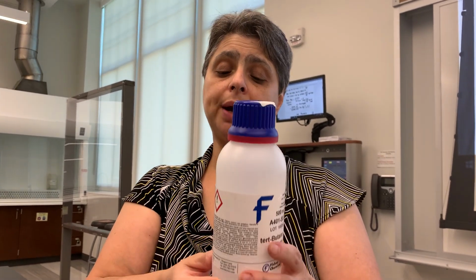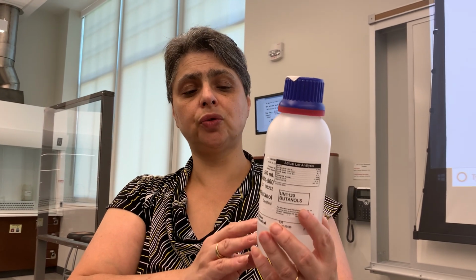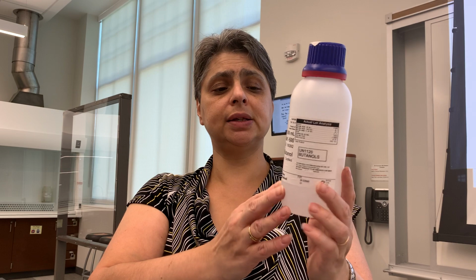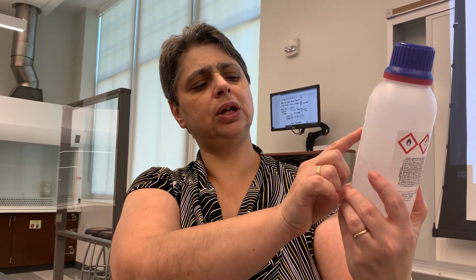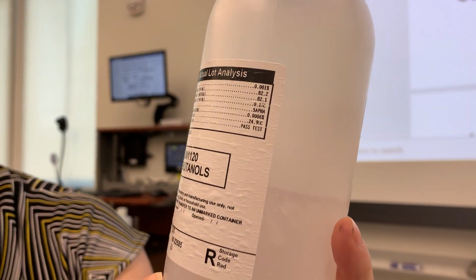So it's an interesting substance which happens to be frozen at room temperature. In fact, this tells me that the temperature in this room right now is probably around 23, 24 degrees Celsius, or definitely below 25, because the expected freezing point of this pure substance is right around 25 degrees Celsius. It says so right here on the label. It says freezing point 24.9. I'm not sure if you'll be able to see it.